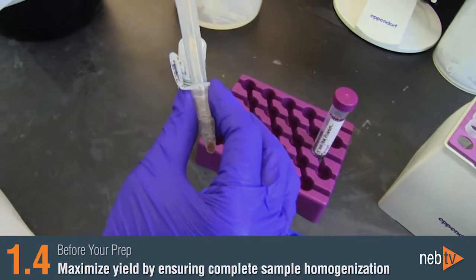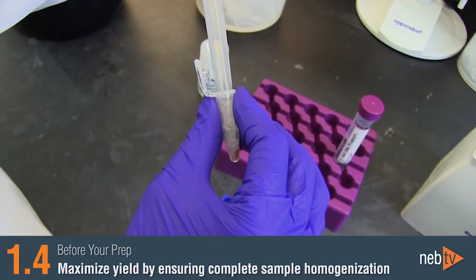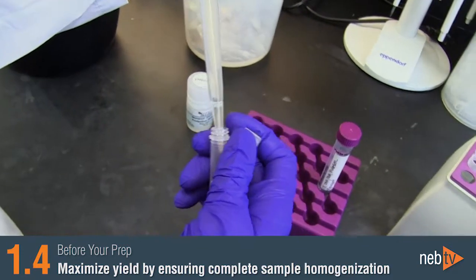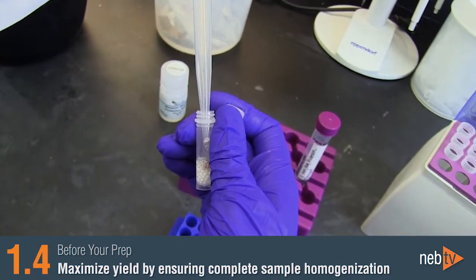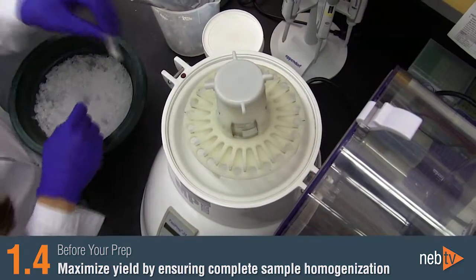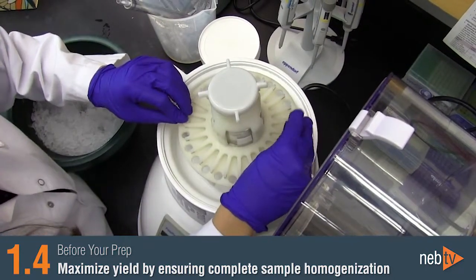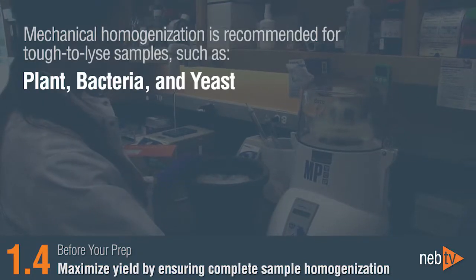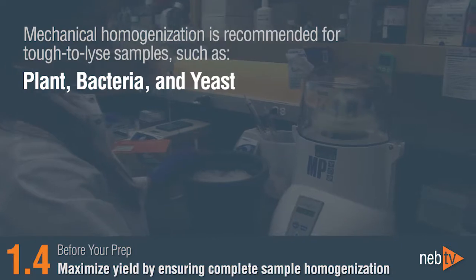Ensure that your samples are completely disrupted and homogenized in order to release all of the RNA and maximize your yield. Mechanical homogenization, for example with a bead homogenizer, can boost your yields beyond those produced by proteinase K digestion alone when working with tissue. Mechanical homogenization is also recommended for tough-to-lyse samples such as plant, bacteria, and yeast.